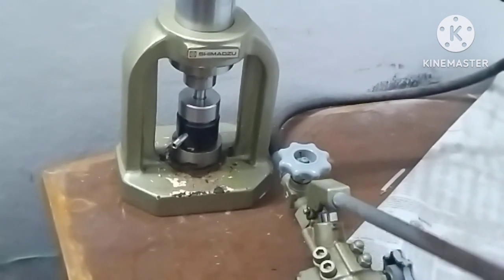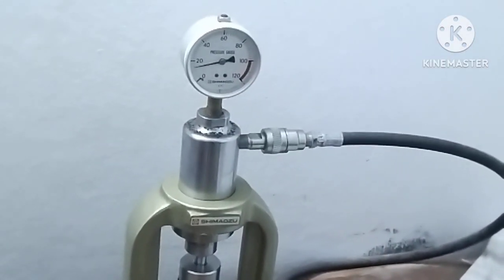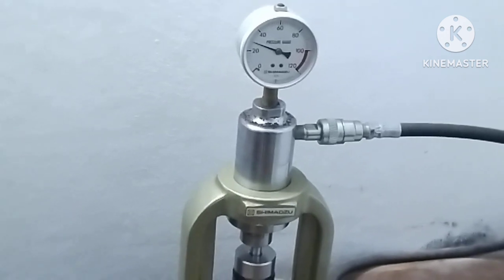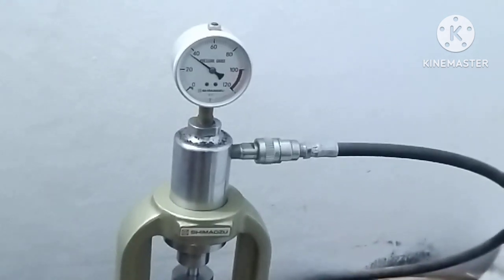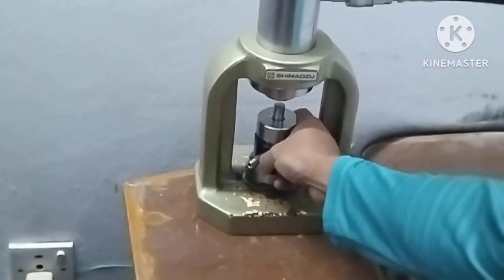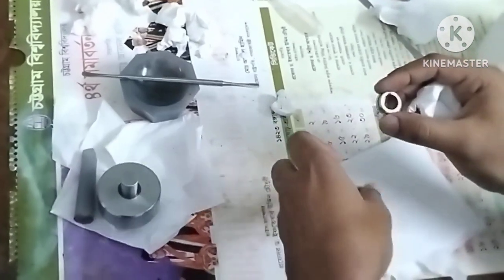You are seeing that it is becoming pressurized in the lower portion, and the pressure is approximately above 20 atm. When it reaches approximately 25 to 30 atm, it's enough, and there is no necessity for larger pressure to create the KBr plate. That means we have successfully completed the KBr plate.